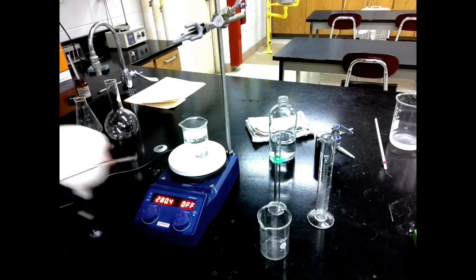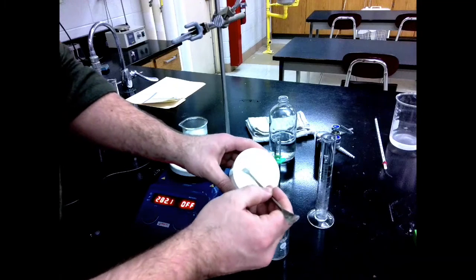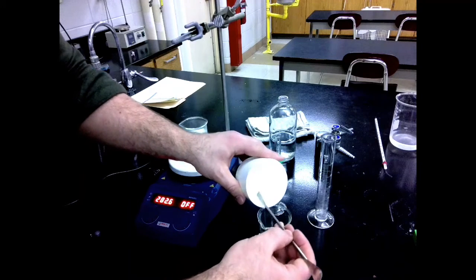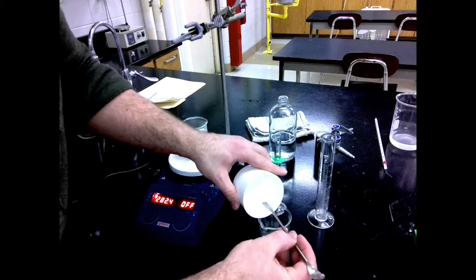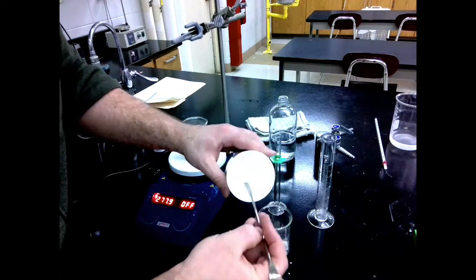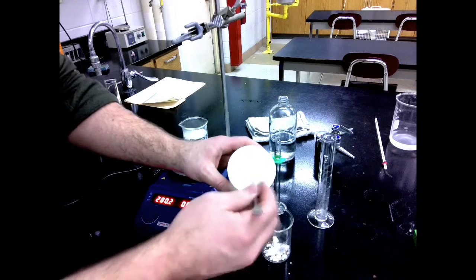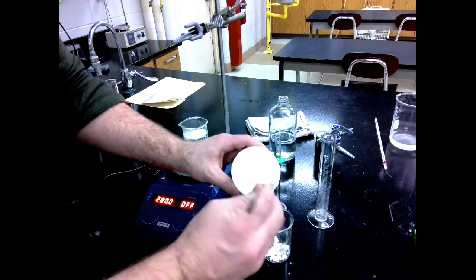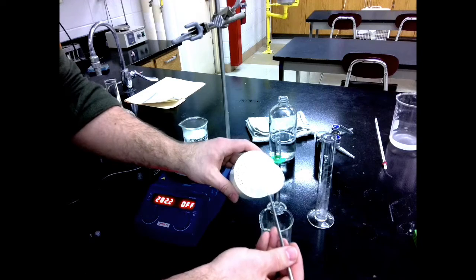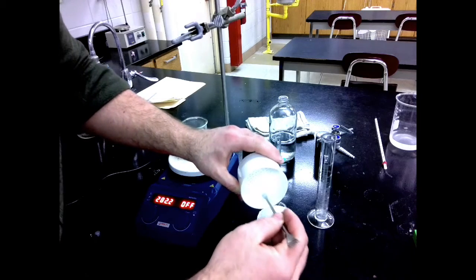So what I'm going to do first is I'm going to just take my spoon here, and I'm going to pull this all out. I'm going to pull out this filter paper and scrape off this aspirin into this 150 milliliter beaker. Just want to get as much of it out as I can, being careful not to spill any. And I'm being very careful as I scrape this so that I don't break up the filter paper. Because now what I want to do is get that filter paper out of there. So there we go. There's the filter paper. And scrape whatever's left over out onto that.